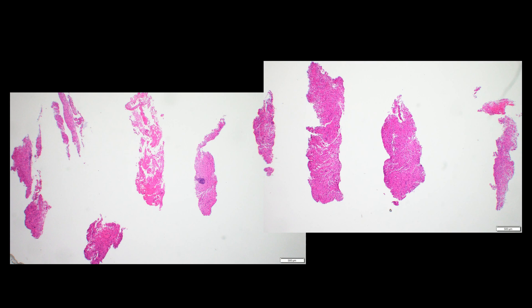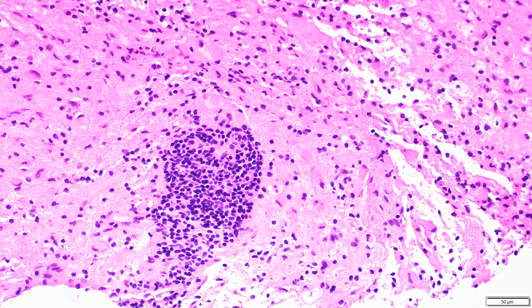This is what a brain core biopsy looks like under the microscope — this is a low power view. I had to take two pictures to get it all on one screen. We've taken our core biopsy pieces, laid them out at basically the same level, and then cut through with a microtome blade. Now that we can see it on a glass slide, we can take a closer look at specific areas and the characteristics within this brain tissue.